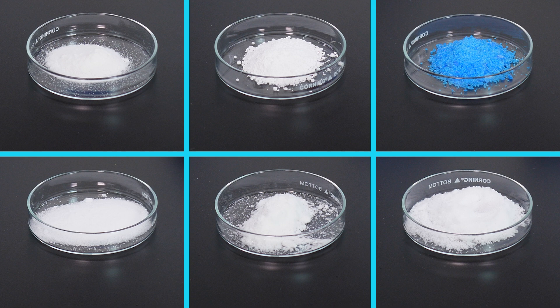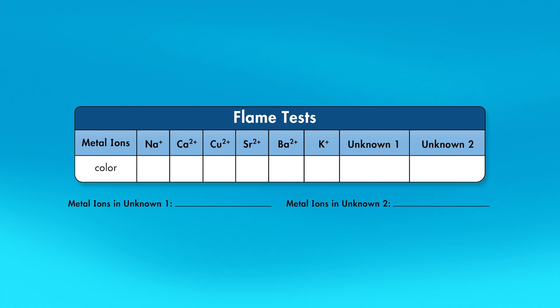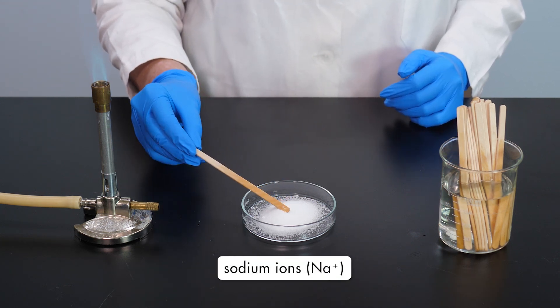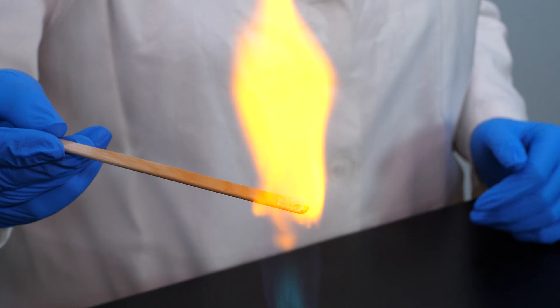We will look at flame tests for six more compounds containing metal ions, then use the data collected to identify two unknown metal compounds by their flame tests. The colors emitted by metal ions during a flame test are often difficult to describe — what appears red to one person might appear pink or orange to another. We will be testing compounds containing metal ions of sodium, calcium, copper, strontium, barium, and potassium. Record the color of each flame test on your table. The first flame test is with a compound containing sodium ions — how would you describe the color of the flame emitted by the sodium ions? Record the results on your table.